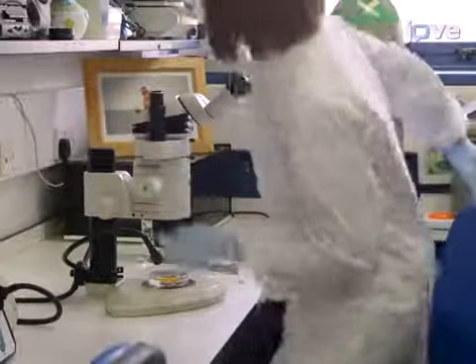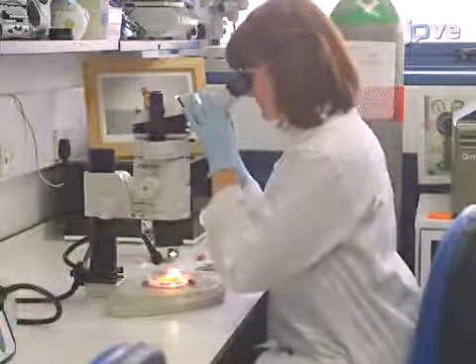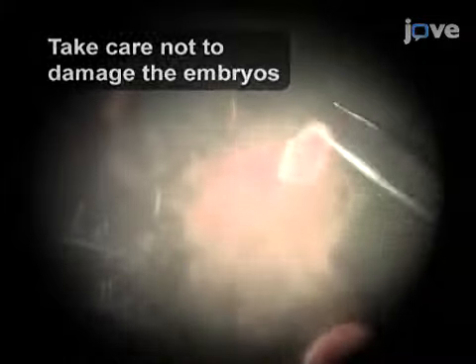After obtaining a mouse uterine horn according to the text protocol, under a stereo microscope, use curved scissors to cut the thick muscular membrane of the uterine horn and carefully extract each embryo. With curved scissors and fine forceps, dissect away the amniotic sac from each embryo.